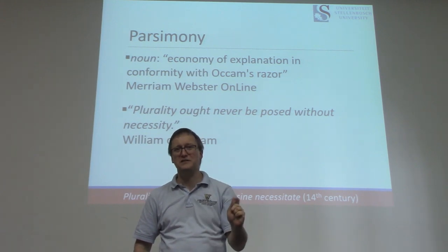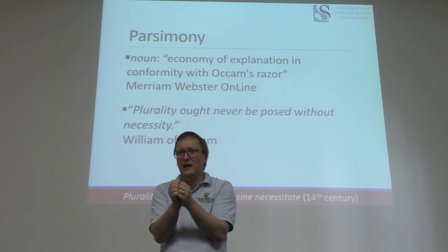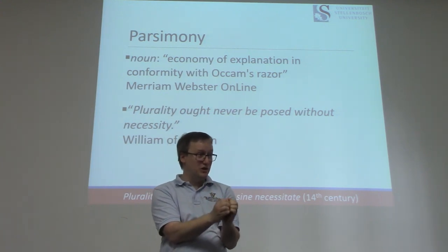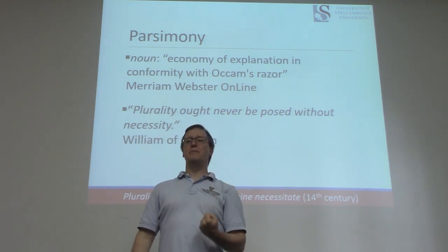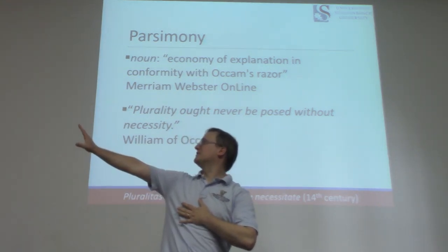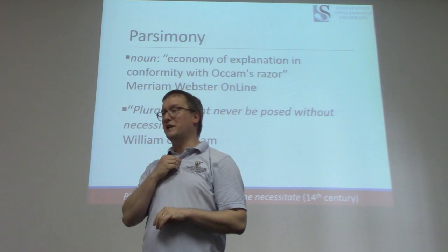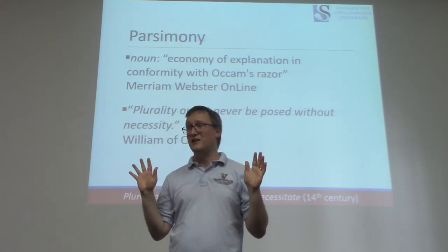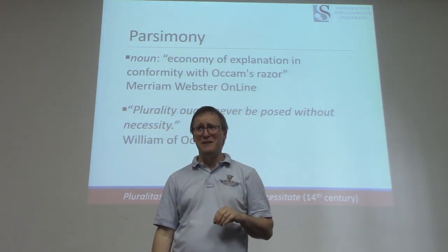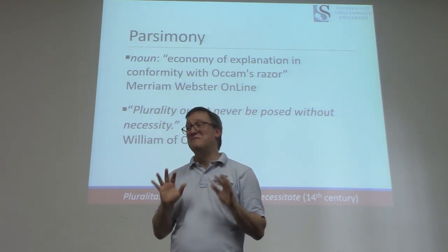In the world of proteomics, this rule about being stingy with your hypotheses definitely applies when you're counting proteins. There is a lot of pressure in the proteomics community to make the biggest possible claim about your amazing technology. With my technology, I can see 20,000 proteins. With my technology, I can see 97% of all possible proteins from Mycobacterium tuberculosis. It may sound like I'm talking nonsense up here, but if you read some of the papers from the big hat proteomics community, you're going to see a lot of claims that are deeply bogus. I'm trying to use controlled language because this is on video. It really makes me mad.